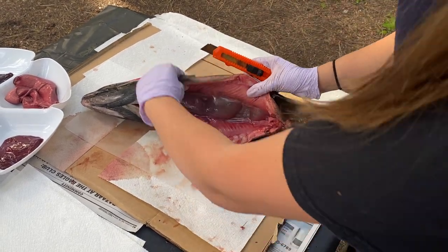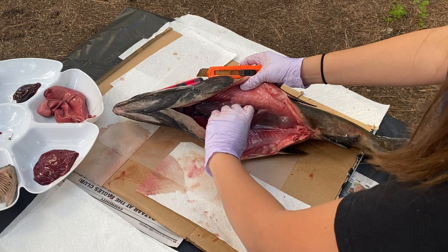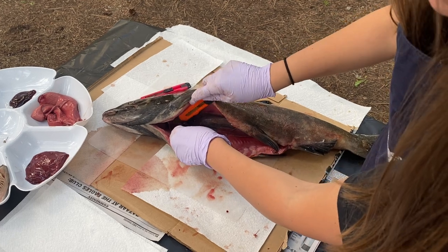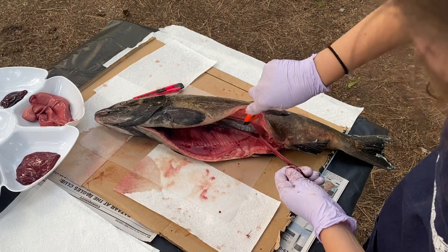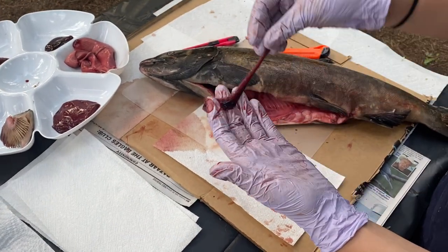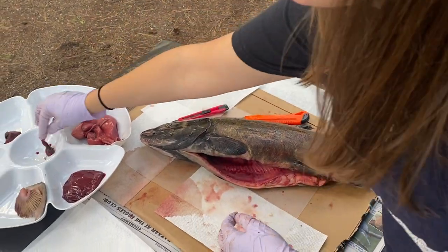And so we can cut them out, and it looks so different once you cut it out versus how it is inside the body. So it already deflated. So we can just cut it out really carefully because there is an organ behind it also. So this is that swim bladder now, right? It just looks kind of like a little rubber worm, and it feels really slimy, but it's a nice thin balloon that they can use to help move throughout the water column.